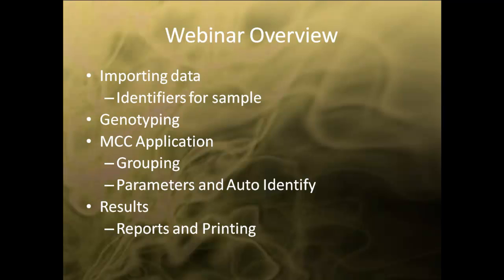We will first discuss how to import data into ChimerMarker to complete the initial genotyping analysis. After genotyping, we can access the integrated MCC module from ChimerMarker main analysis window to complete groupings of patient files and set the parameters. Finally, we will review the MCC quantification and allele identification in results window. The report can be either saved or printed directly from this window.